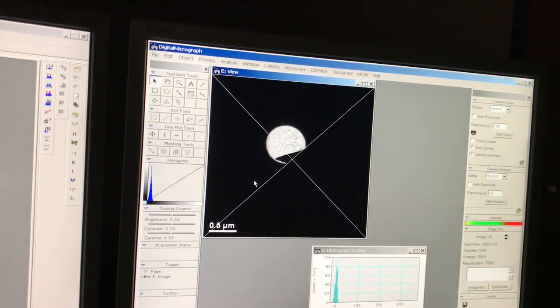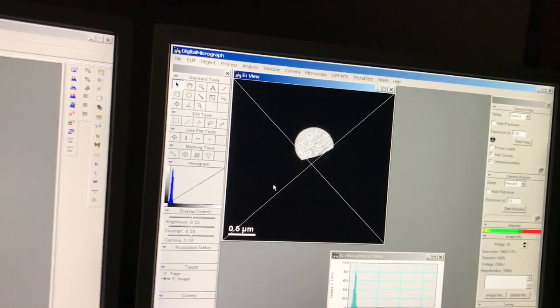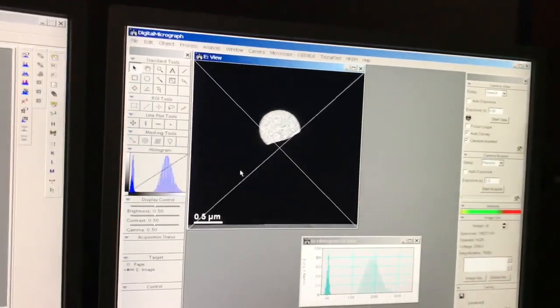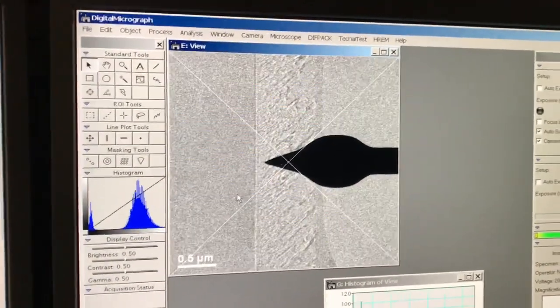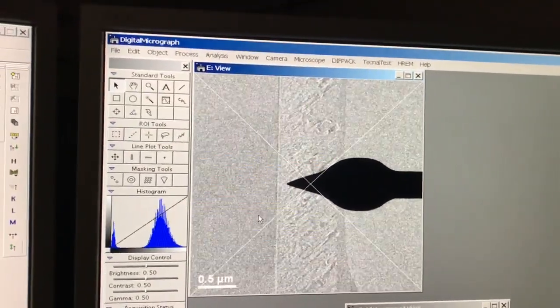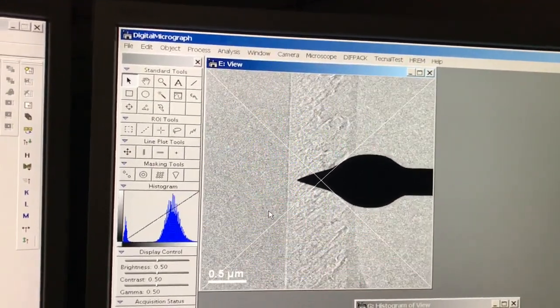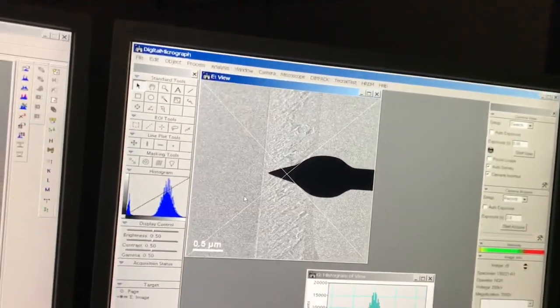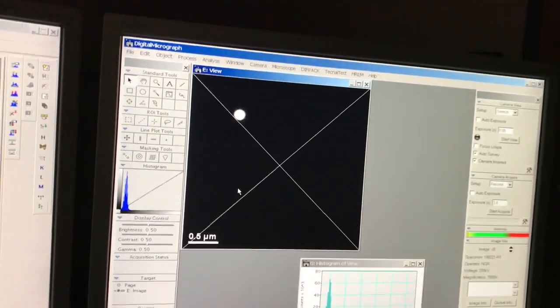So you can imagine if my film was thinner. Just looking at it right there, the film is about 3/4 of a micron. But what if the film is thinner this way again? What if it's thinner than my field limiting aperture diameter? Well, I need to use the smaller aperture at that point, and that's why you have aperture 1 here if you're going to do that, which is right there.